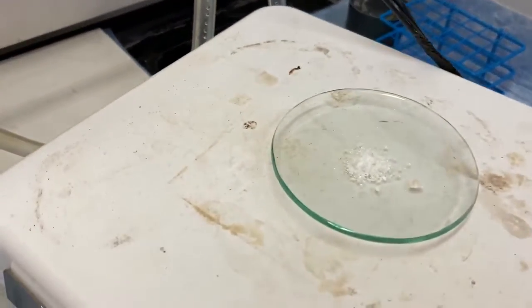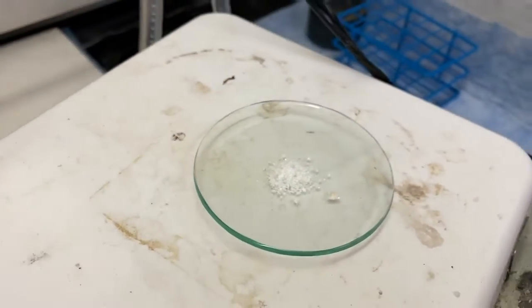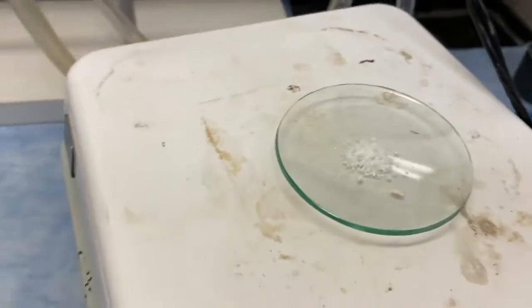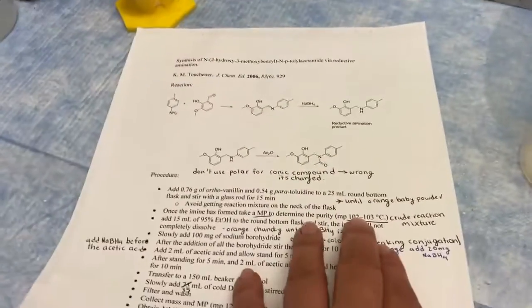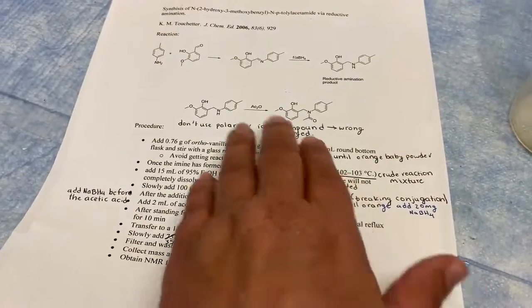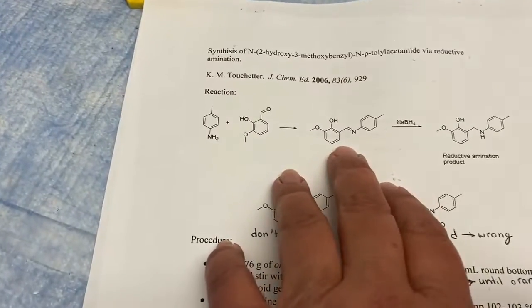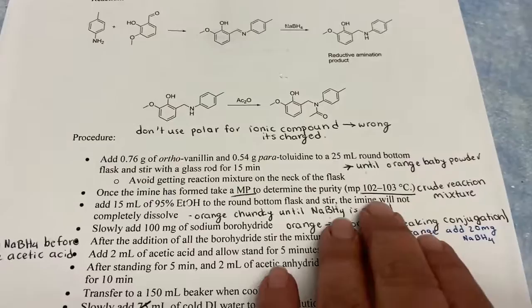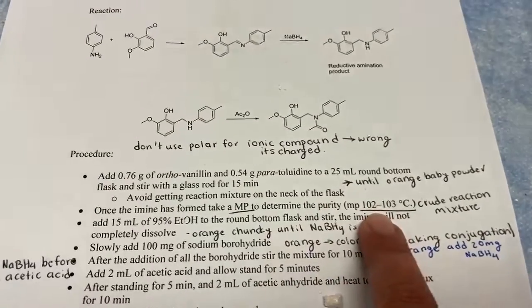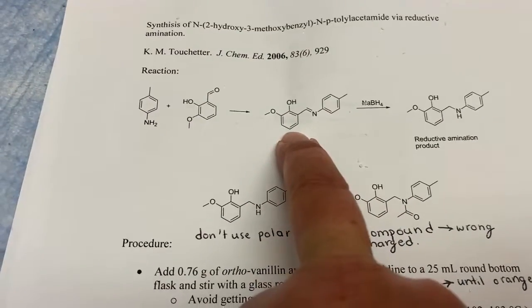Something to keep in mind, the melting point of the imine is 102 degrees. Now, remember, that was the orange compound we made at the beginning, okay? And so it's got a melting point of 102 to 103. We did not purify this compound. Okay, and so if you're thinking about the melting point of this, most likely this is going to be depressed and broadened. Why? Because we didn't do a purification step with this.